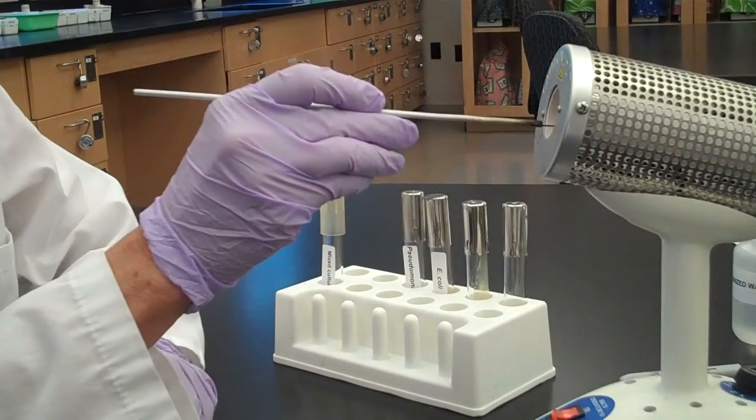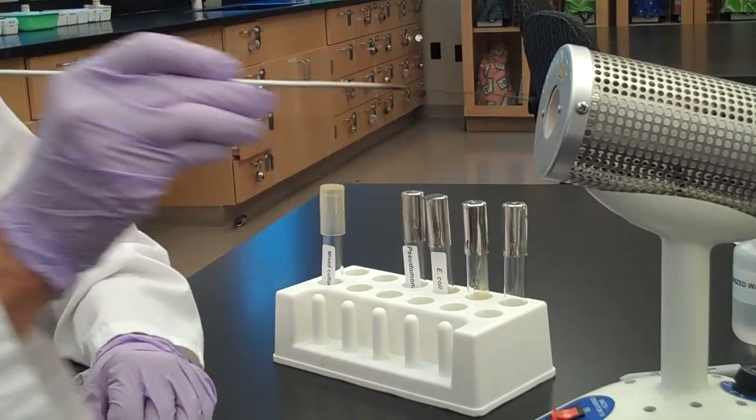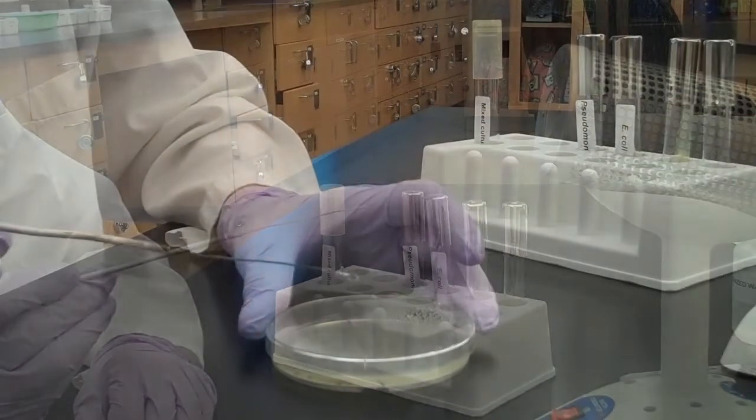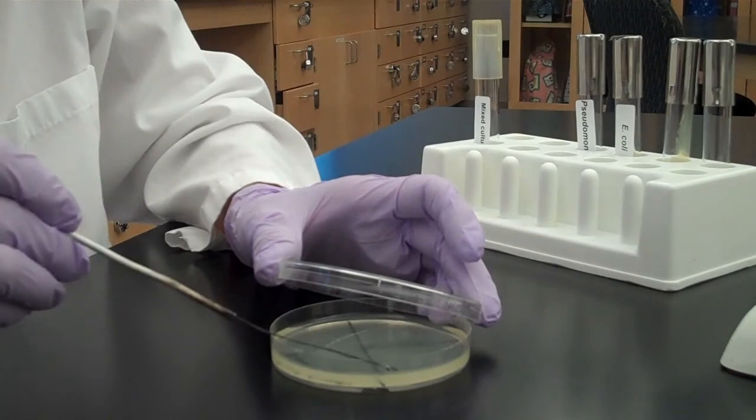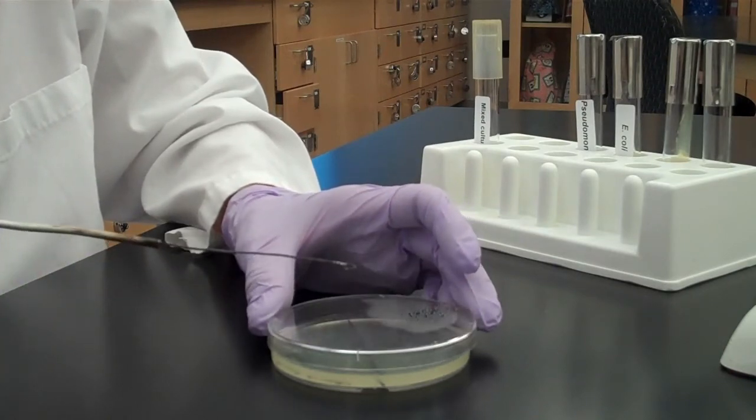Sterilize your loop and let it cool. Drag bacteria one time from the middle of section 2 into section 3 and spread it out to fill section 3.